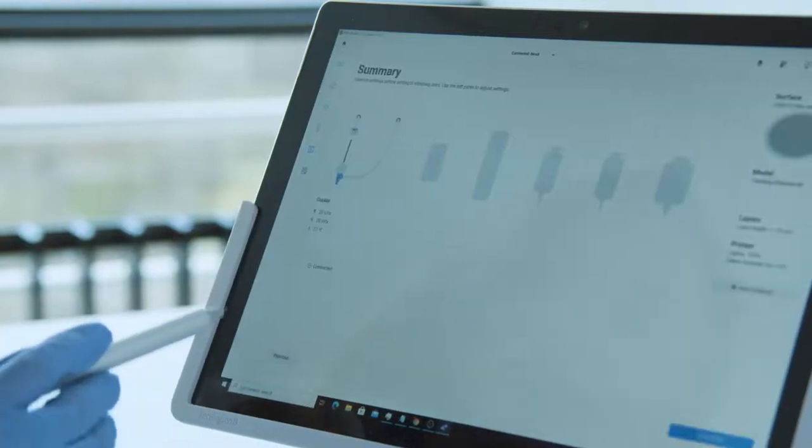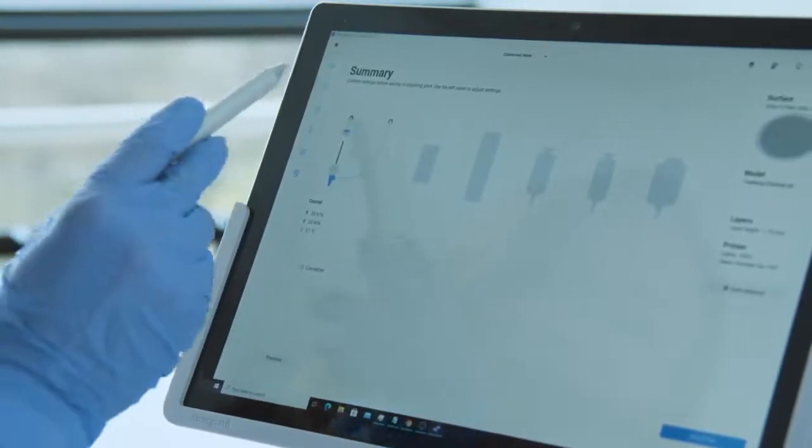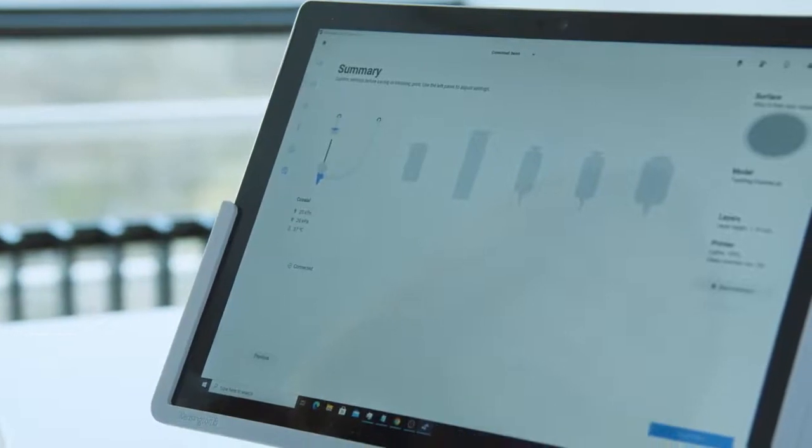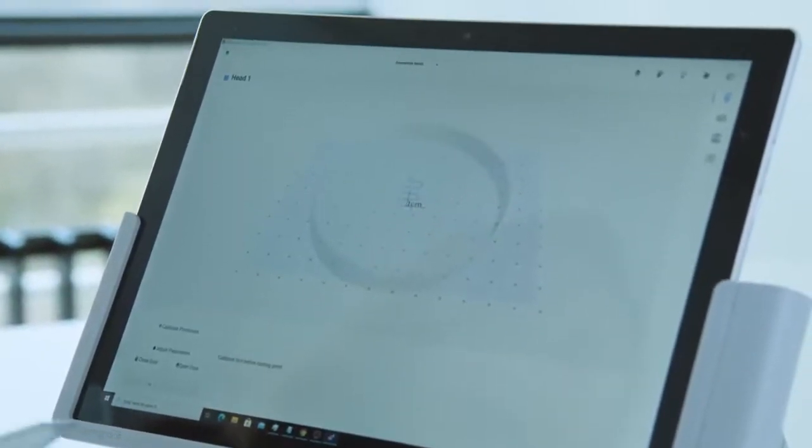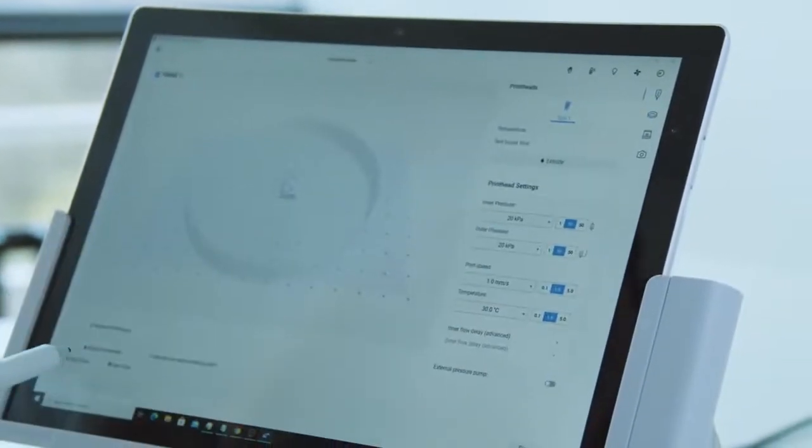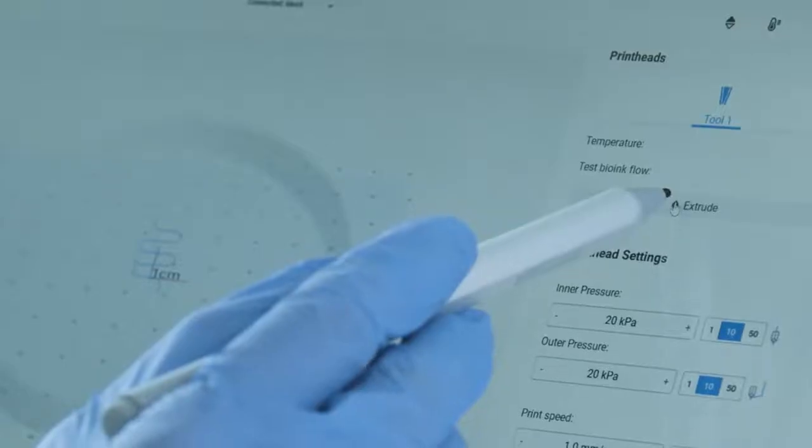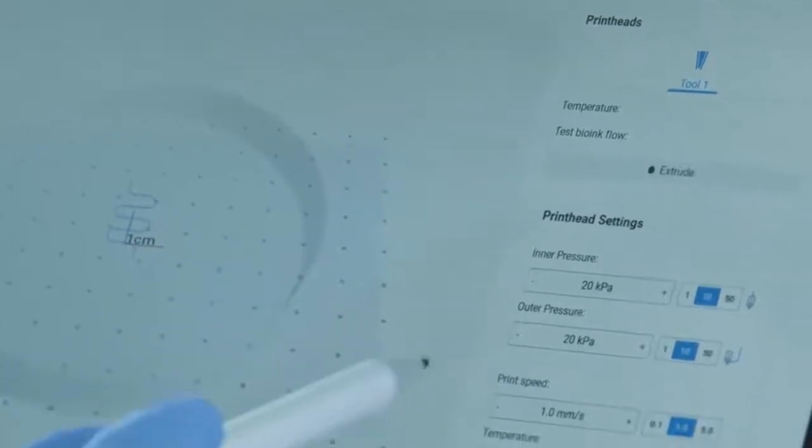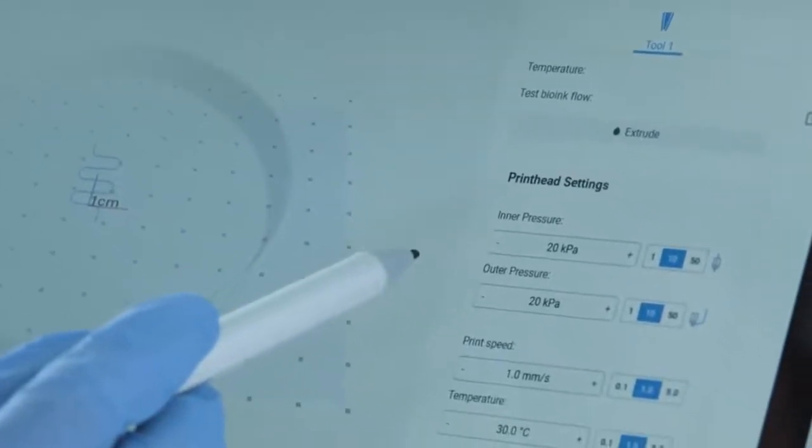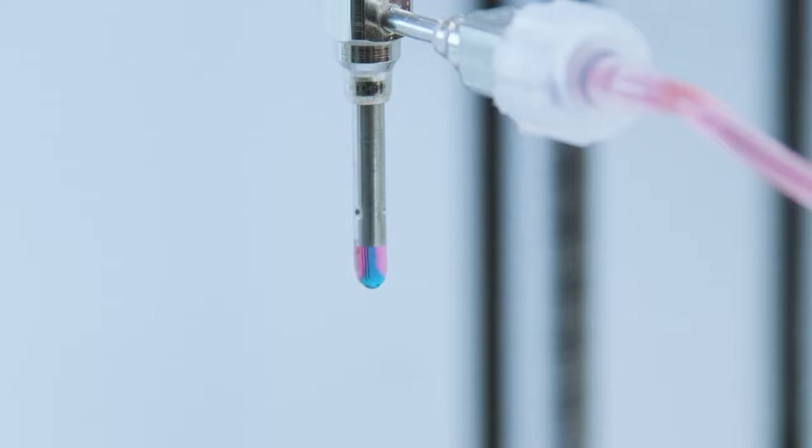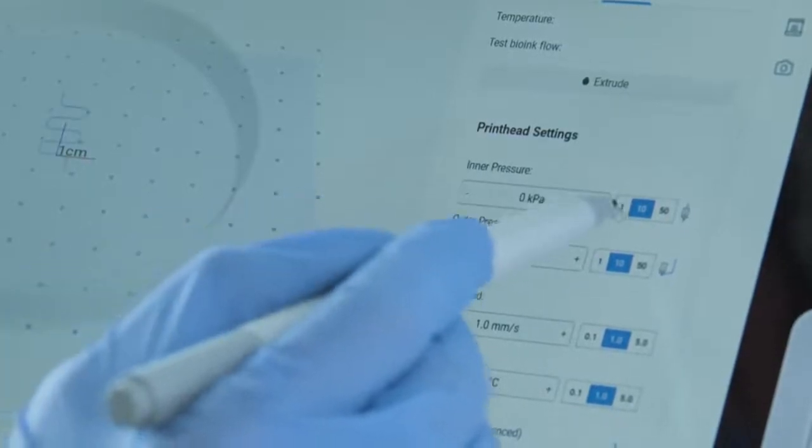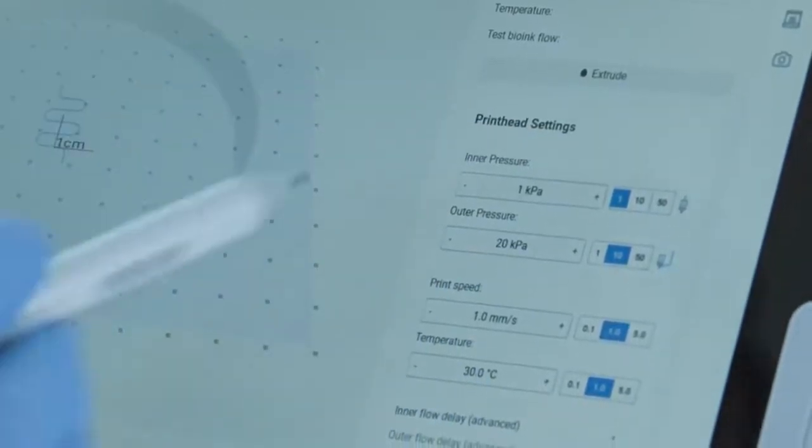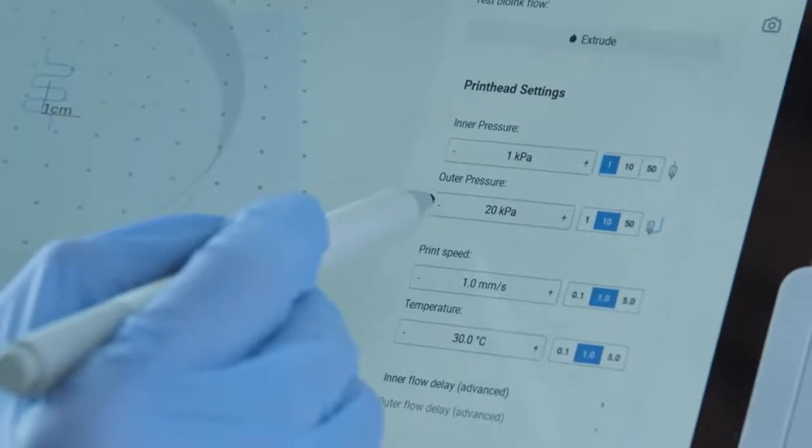Here you can see the summary of the printing settings. Press go to print. From the right panel you can test the extrusion before starting to print and make sure that the inner and outer extruded bioinks are visible and concentric when you are printing. You can use this panel to adjust the printing settings further, even during the bioprinting process, to improve the resolution.